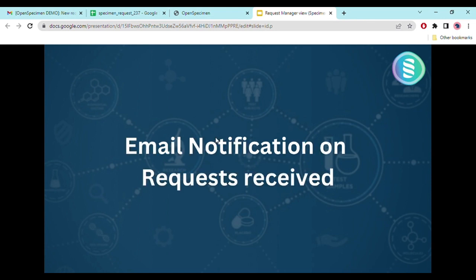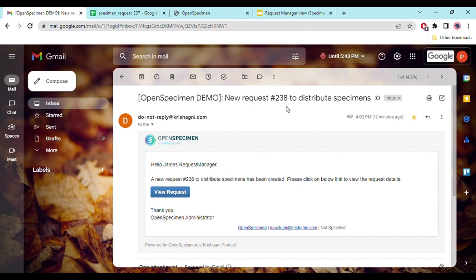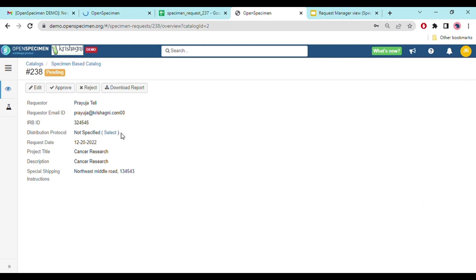Whenever a researcher puts a request for specimens, the request manager receives an email notification. For example, if request #238 is put by a requester, you will receive an email saying that new request #238 has been submitted. Once you click on the 'View Request' option in the email, you get navigated to that request so you can see the details and the specimens that have been requested.